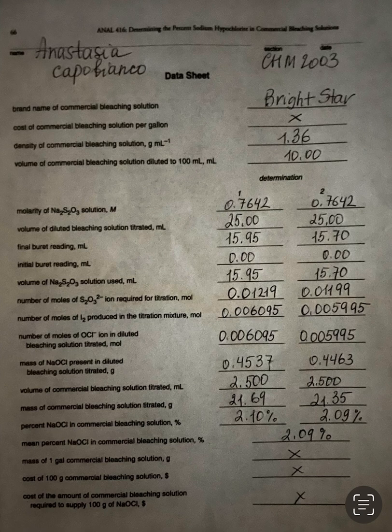What are we doing over here? As you can see, I have two determinations for determining the possible percent sodium hypochlorite in my bleach solution. For the name of my bleaching solution, I just wrote Bright Star. You have something different. We are not looking for the cost of the commercial bleaching solution per gallon. We are not going to be calculating any type of cost, the mass of 1 gallon of bleaching solution, or the cost of 100 grams.